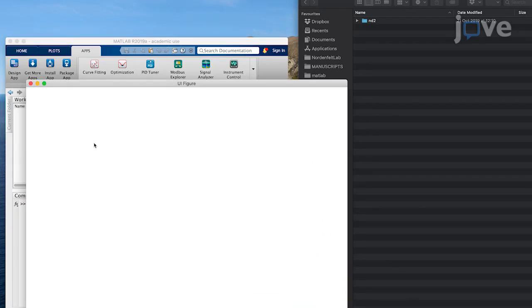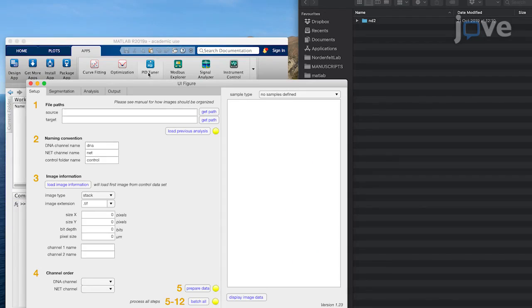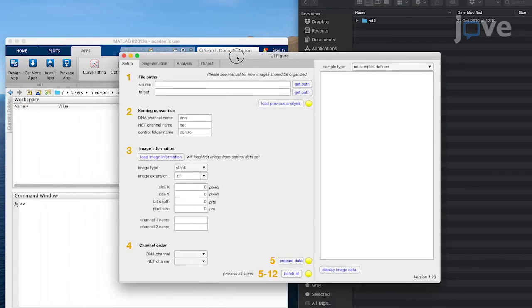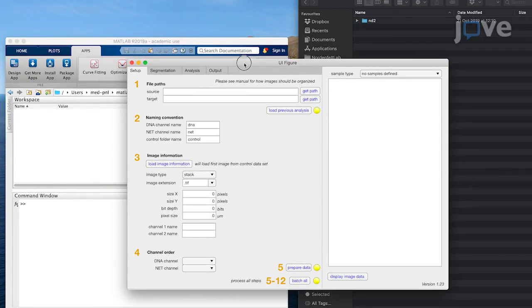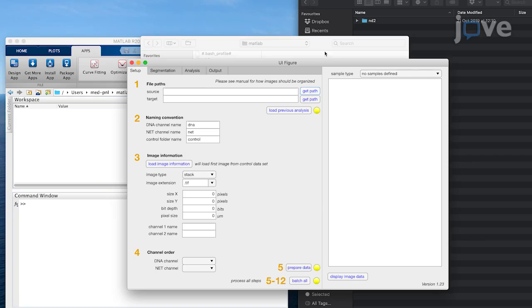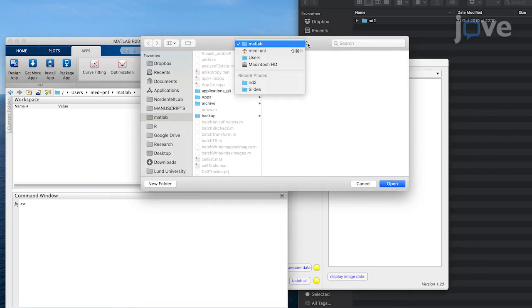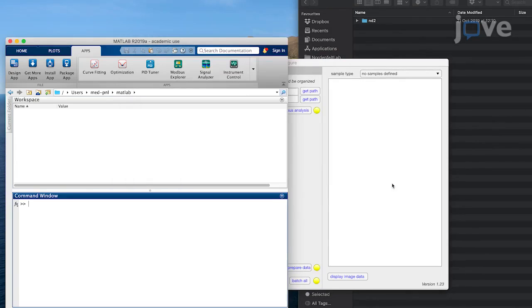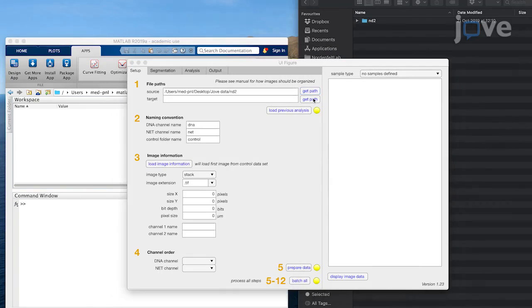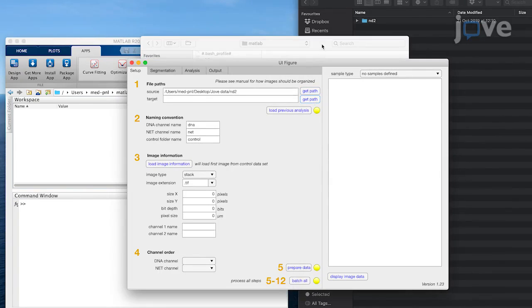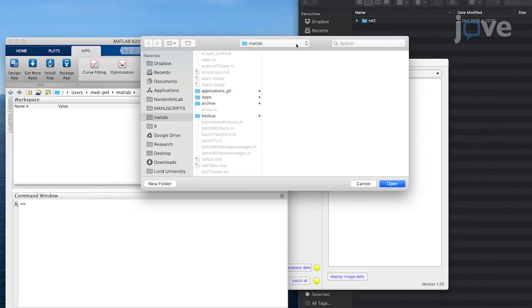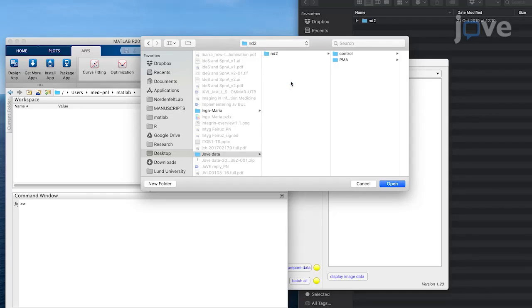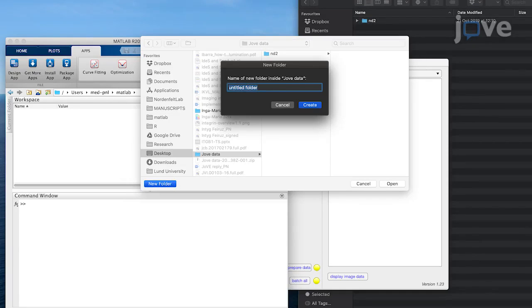In the Setup tab, choose a source folder for analysis by clicking the Get Path option in the Source menu. Select the folder containing the image sequences to be analyzed. Click on the Get Path option in the Target menu and select the target folder for saving the data following image analysis.